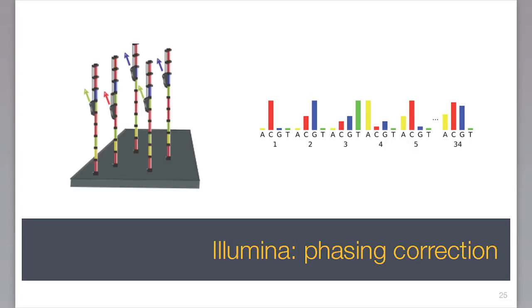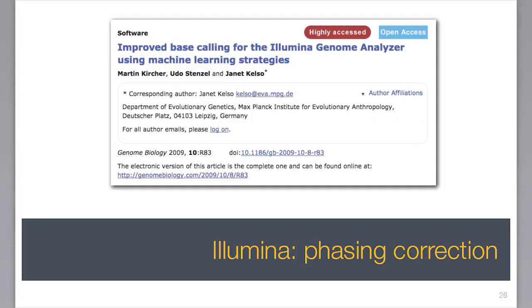That sounds like a machine learning problem. And yes, that's actually one of the papers from Janet Kelso, one of Wynn's PhD students, that I had to dig out. It's from 2009, so it's been around for a while. People started coming up with different models to figure out, if I have a string of characters that is generated by those chemical processes and read by those mechanical or optical processes, what are the error profiles? How do errors accumulate? And then you can model that.